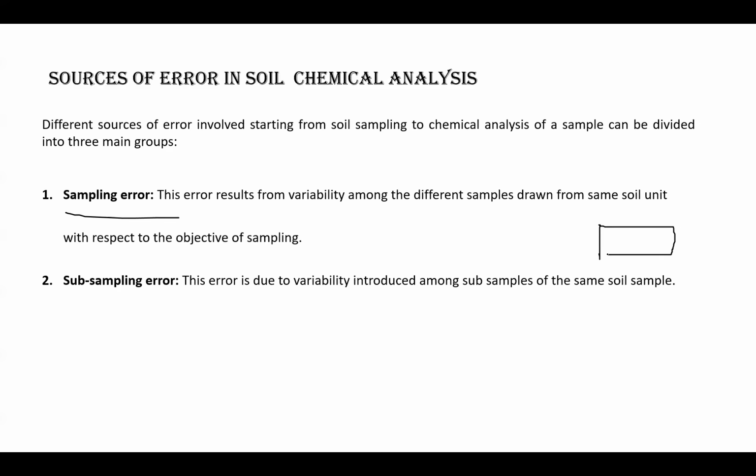We collected one sample here, one here, one here, one here, and one here, like in a zigzag fashion. We have to mix this sample properly. Moreover, our depth should be the same. We have to go to almost 15 centimeters depth.